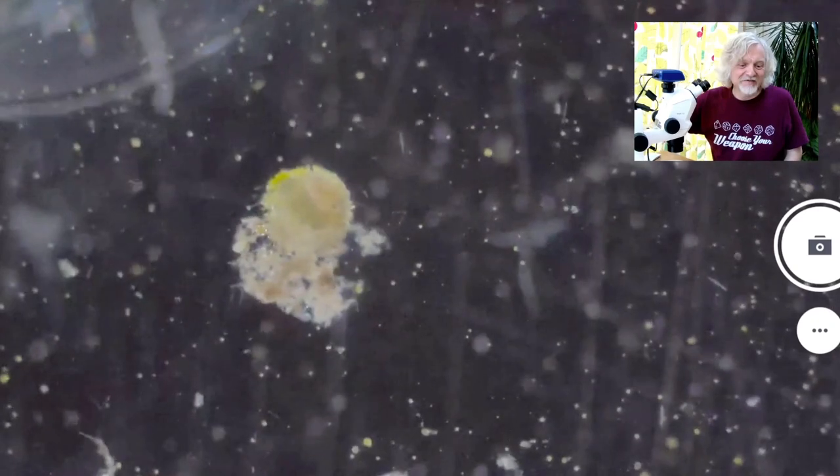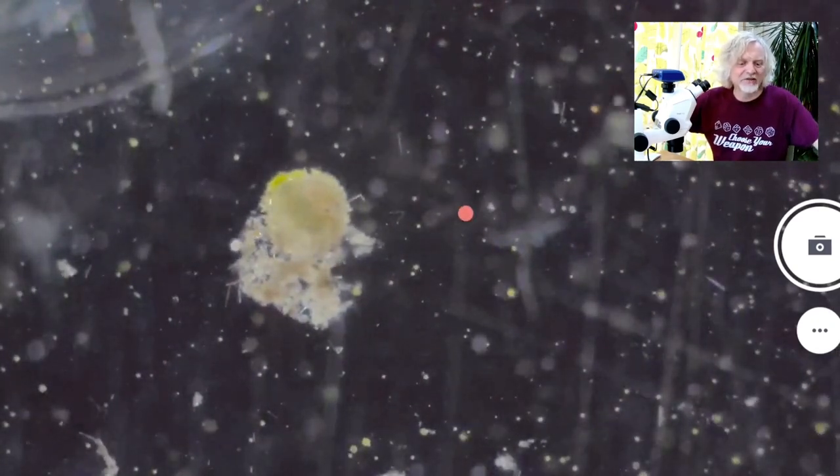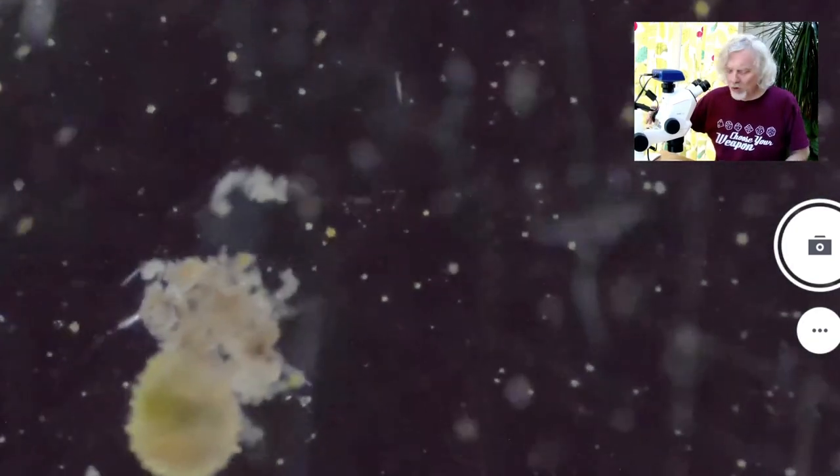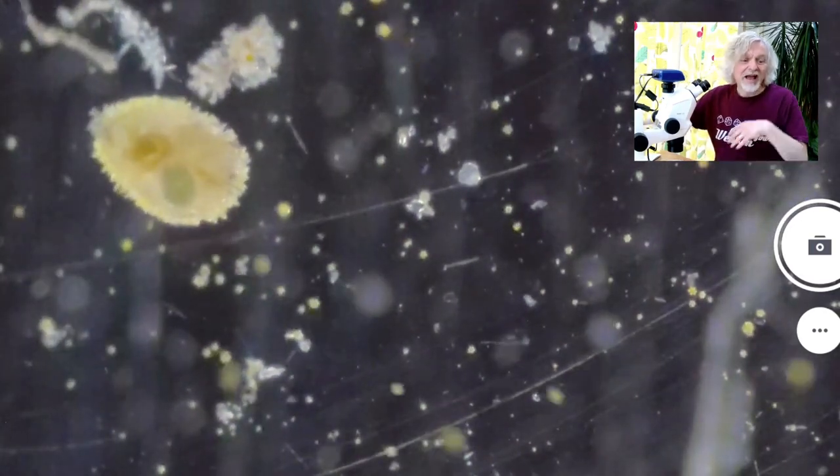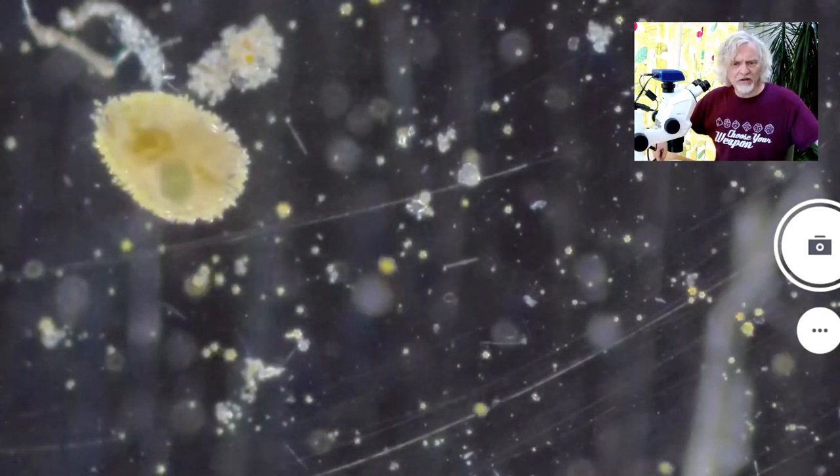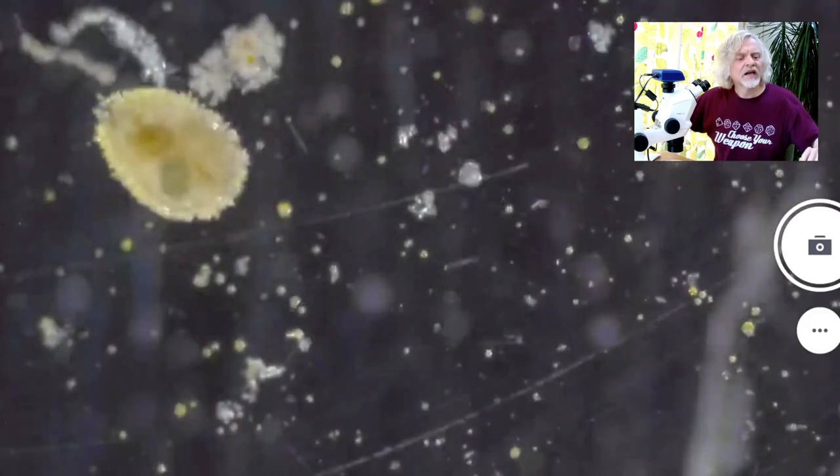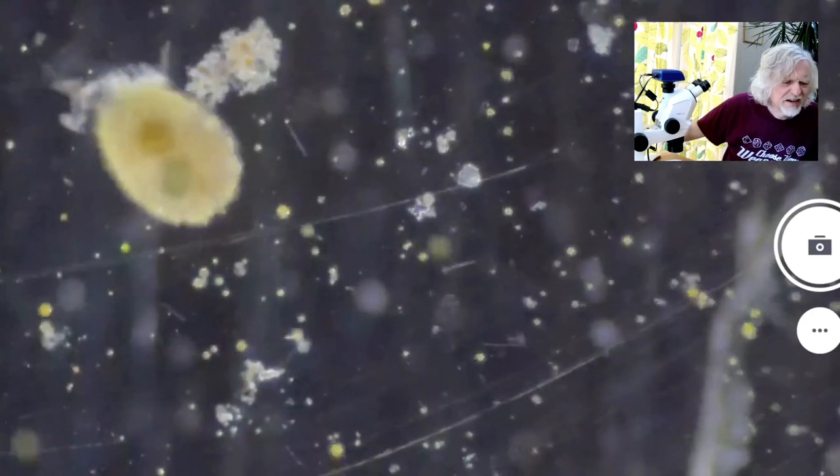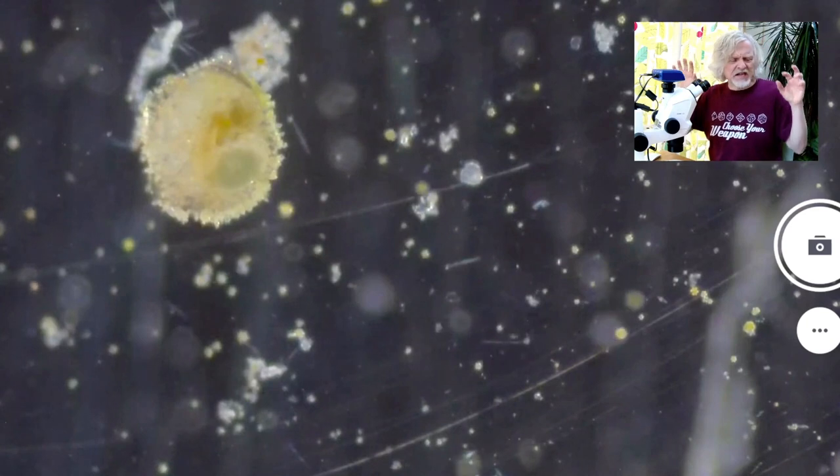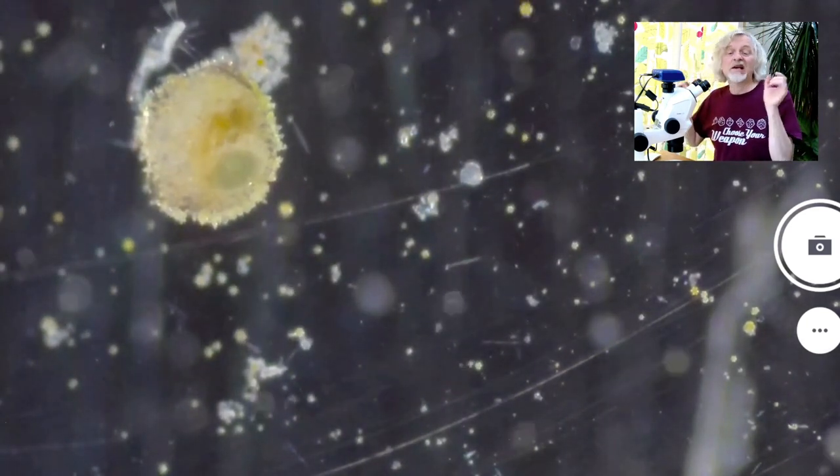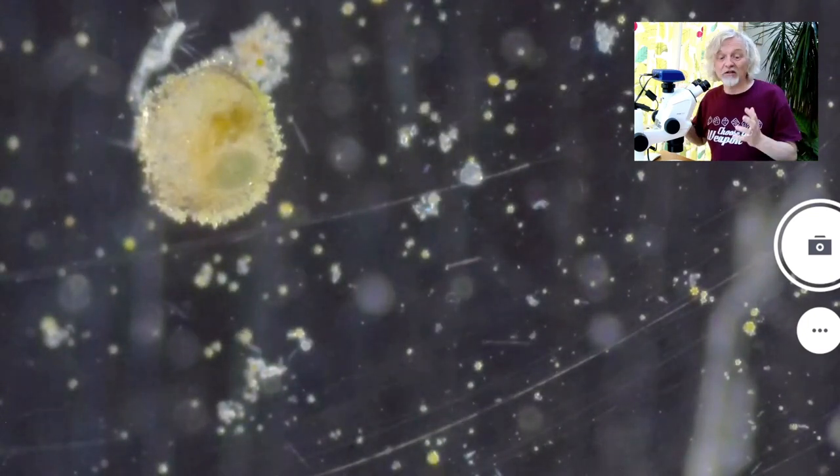But you can see there's actually loads of other stuff going on in here. Can you see all these tiny, tiny, tiny around here? There are loads of tiny, tiny little green blobs. And in fact, the longer you watch, the more you'll see. There are, in fact, loads and loads and loads of things living in this water. And everything that's moving is alive somehow. And the other thing you can see is if I turn the lighting back to the ordinary lighting like that, there's the ostracod. You can see there's the back of its shell. There's its head. It's a little eye spot there. But if I do this, can you see all around the edge of the ostracod? And if I just focus very carefully, it almost looks like it's sort of a bit fuzzy. And that's because something, I'm not sure what it is. It's green. So it's probably some sort of little tiny, tiny little bits of algae are actually growing on the shells of the ostracod. And you can see that only because we're looking using this special technique, which is called dark field for obvious reasons, because it gives you a dark field.